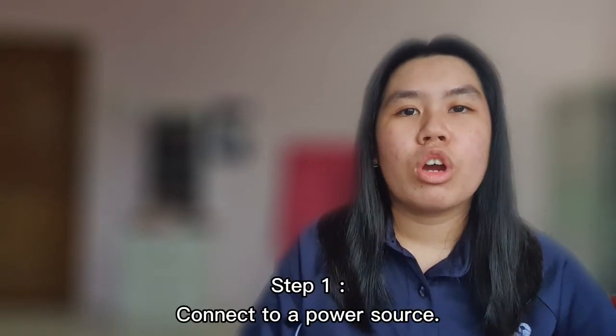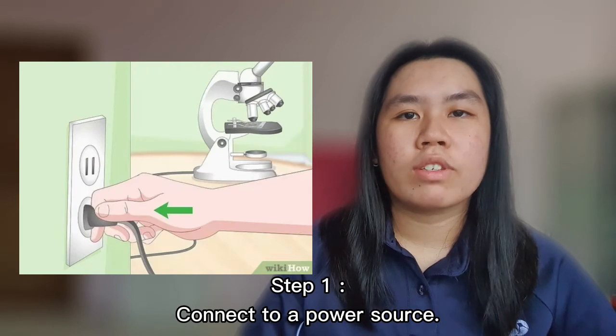Now I'm going to share about the method to use a microscope. Step 1. We should connect the microscope with a power source. If we use a mirror instead of an illuminator, this step can be skipped. Instead, you can find a place where the natural light is easily accessible.